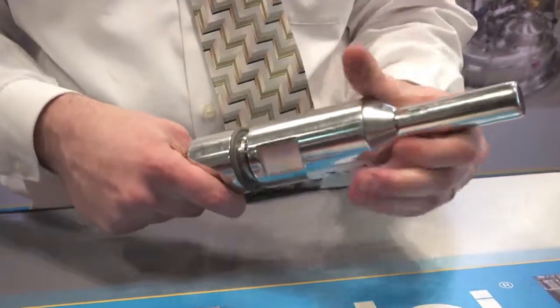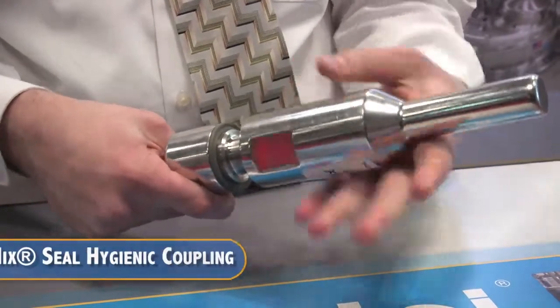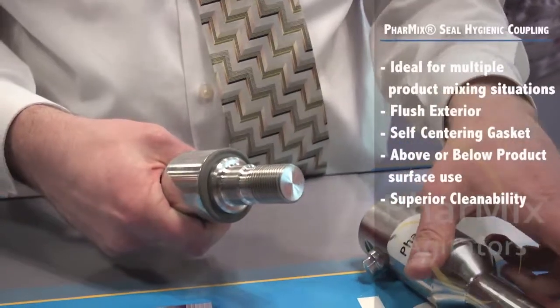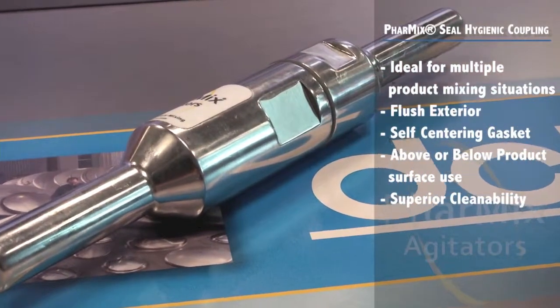Our patent-pending Farmix seal hygienic coupling is ideal for multiple product mixing where impellers are changed to match processing requirements, or when one-piece continuous shafts cannot be installed. The Farmix hygienic coupling is supplied with a flush exterior, smooth profile, and self-draining o-ring design.